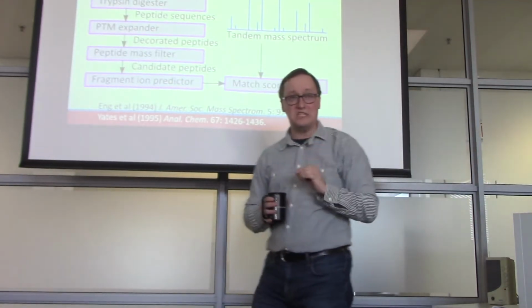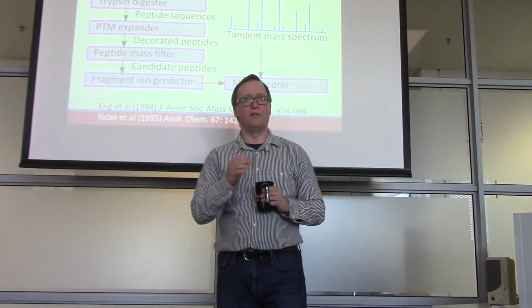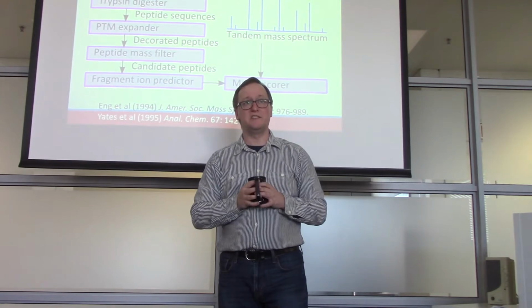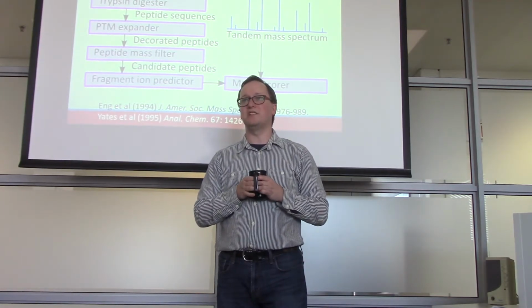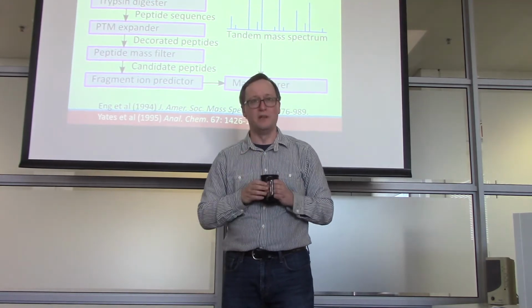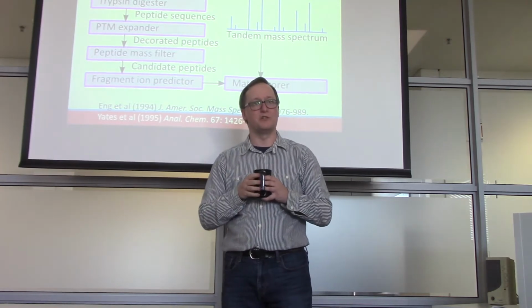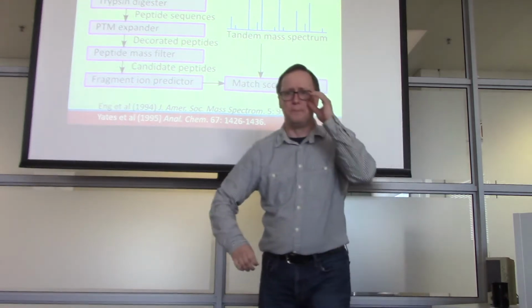All right, this diagram is in many ways, in my thought, the most important one of the whole talk, because this is the bread and butter of proteome informatics. This is a diagram of how database search engines work. Database search engines are like the central tool. They are the tractor of our field. And everyone who does proteomics at some point is going to use a database search engine. So, how do they work?